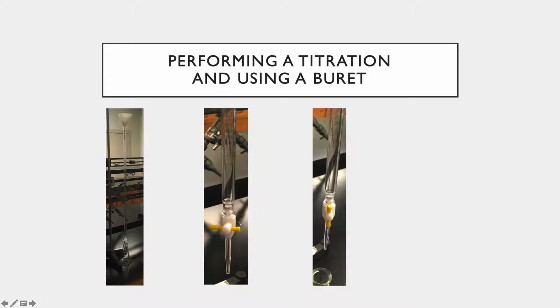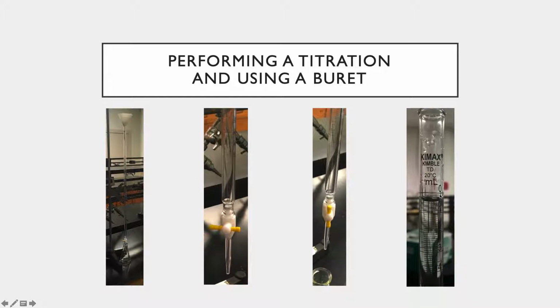How we can control how much we add is that we're going to look at our burette, and we don't always have to fill it exactly to the zero mark at the very top.